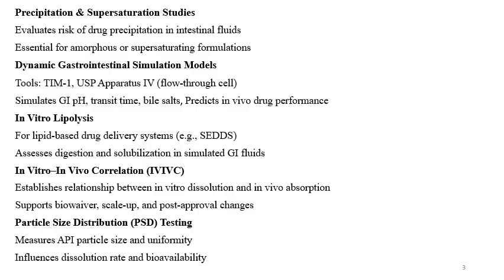In vitro lipolysis testings are there for lipid based drug delivery systems, self emulsifying drug delivery systems. You can go through the demonstration of bioequivalence via in vitro lipolysis. Assessing the digestion and solubilization in simulated GI fluids can prove the in vitro bioequivalence and can support the bioequivalence.